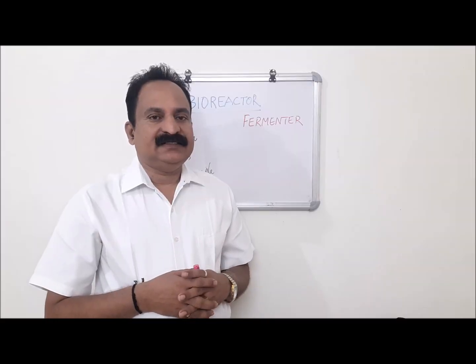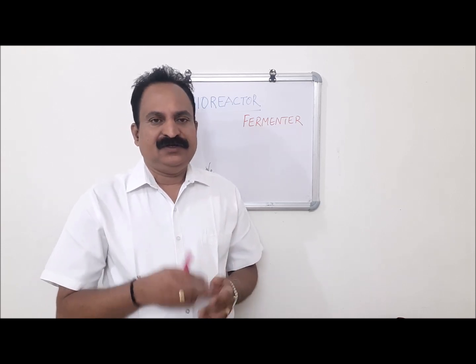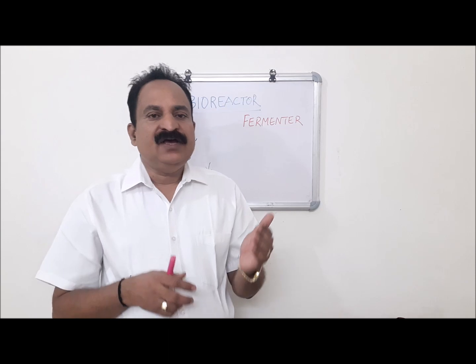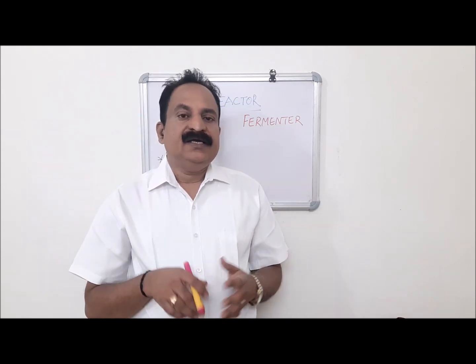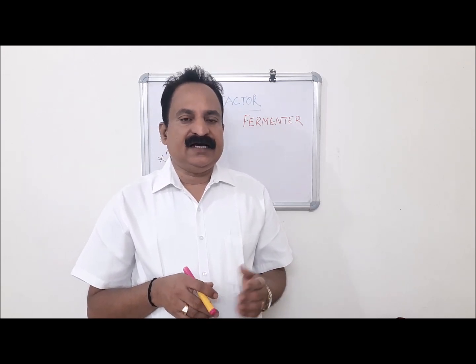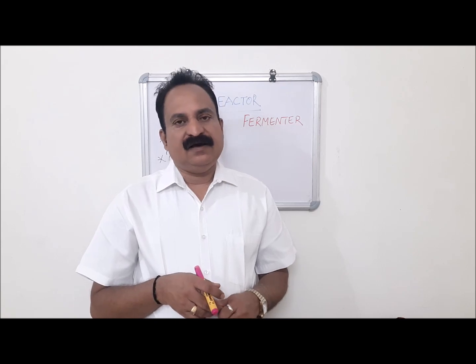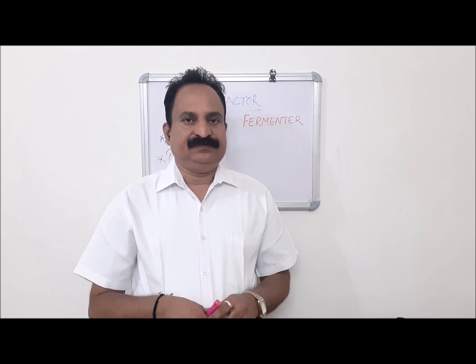We can discuss about bioreactor or fermenter. A bioreactor is a fermentation tank used for the production of various chemicals and biological reactions. It is a closed container with adequate arrangement for aeration, agitation, temperature control, pH control and drain overflow to remove the waste biomass of cultured microorganisms along with their product.